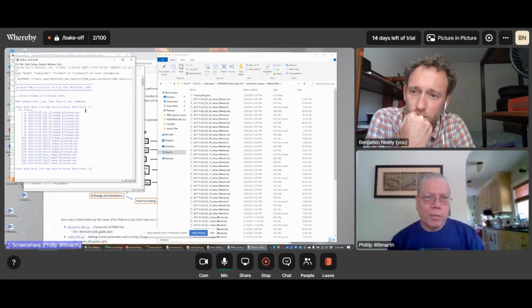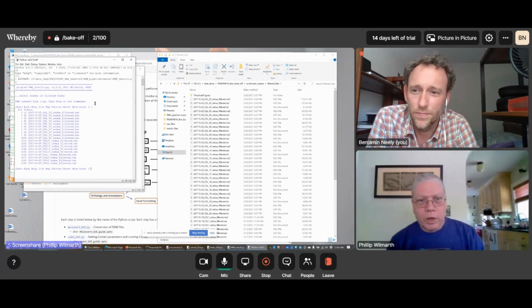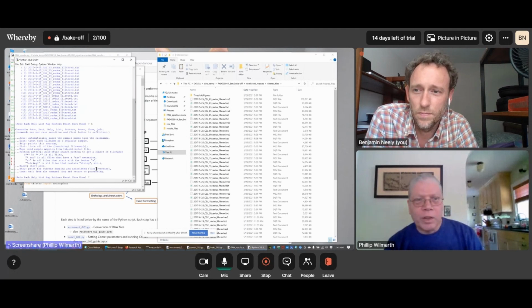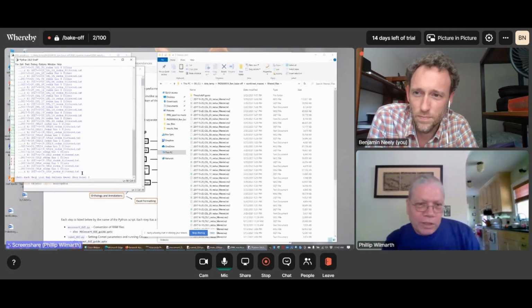And now we need to assign them basically a minimal experimental design. Here it's a label-free quant experiment, so each individual raw file is a separate biological sample, so we don't need to group together. We don't have a multi-dimensional separation where we've got first dimension fractions that we need to combine in the biological samples. So we can also get a little bit of help information here. So just treat each file name as a separate sample. That's what we want to do. Now we've got all of our 19 samples specified as separate samples. We can list if we've got any leftovers. We don't have any remaining files, so we've assigned everything to something in the experiment.